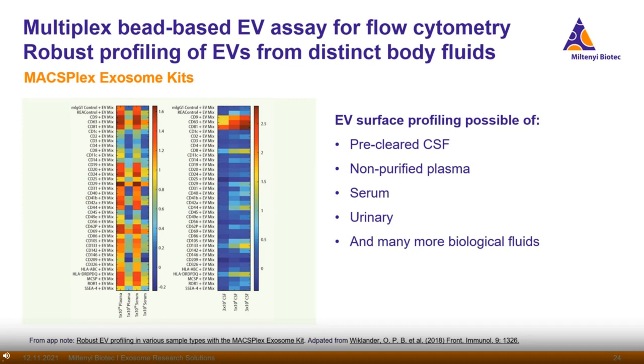Therefore, under standardized conditions, the Multiplex bead-based assay not only represents a valuable tool to characterize, but also to compare EVs from different sources.